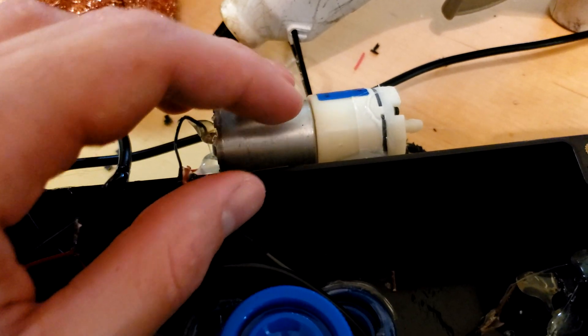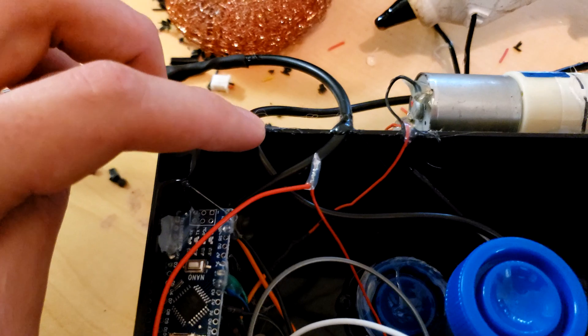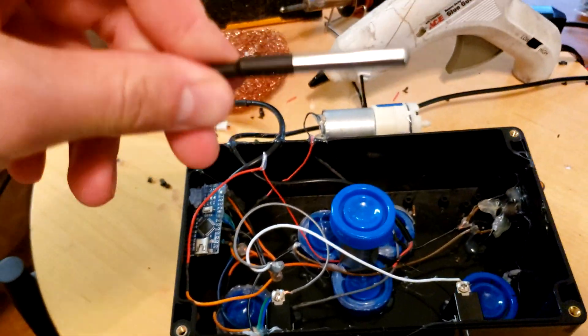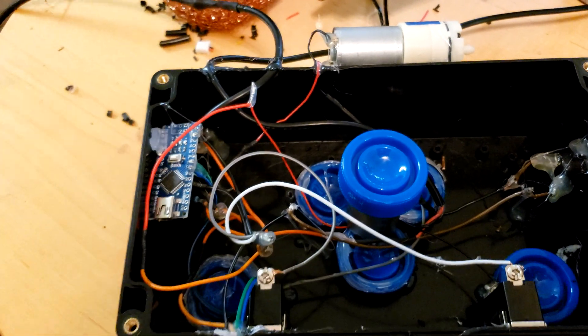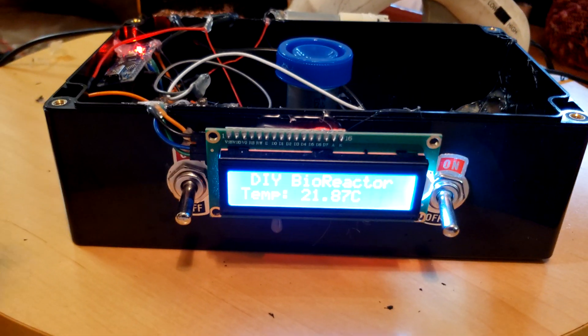Our blower motor, and I have tubing for that as well. This goes to the power cable. This goes to the temperature probe. This is what the temperature probe looks like. I made sure it has a long cable so that it actually fits in whatever container we're using. It's got a power switch on the side.